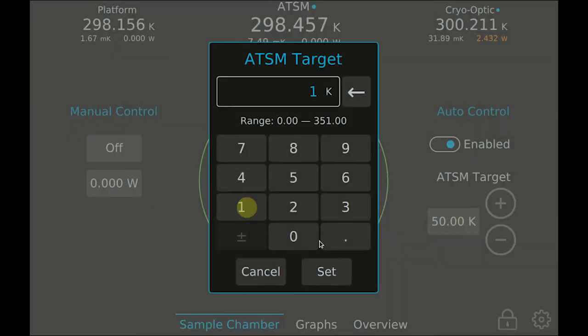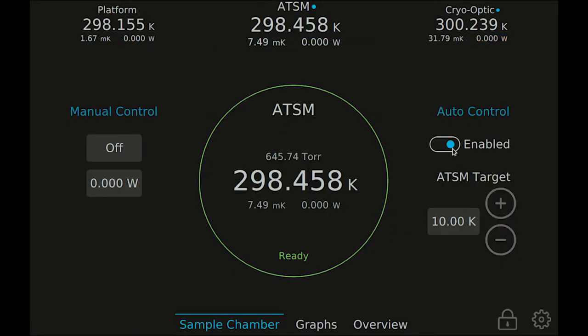Set your desired target temperature for the ATSM, enable the controller, and then navigate back to the platform view to begin the cool-down.